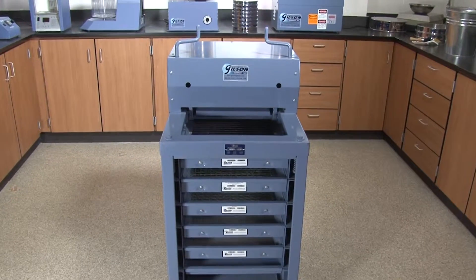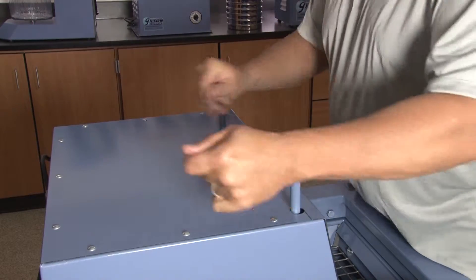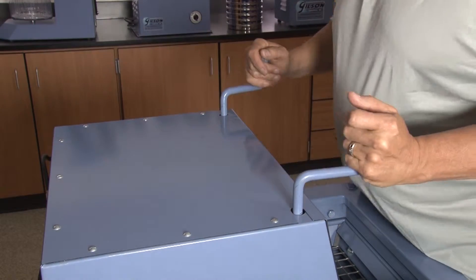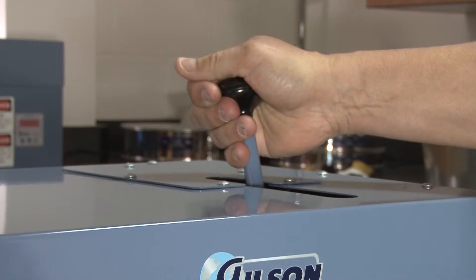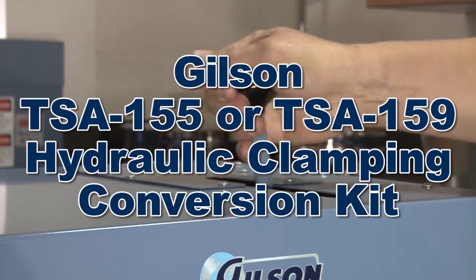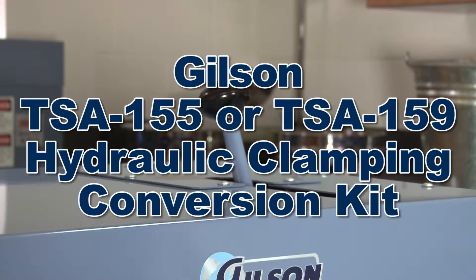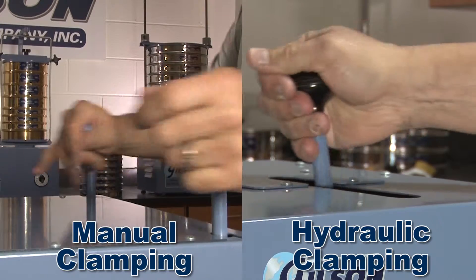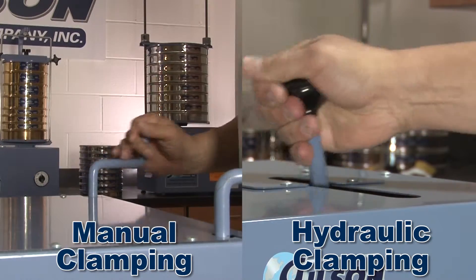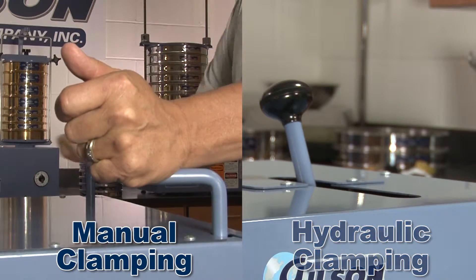Labs with existing TS2 models, with its manual tray clamping system, may increase operational efficiency by upgrading their unit with the Gilson TSA-155 or TSA-159 hydraulic clamping conversion kit, which transforms the TS2's tray clamping system to the same fast-acting hydraulic clamping system used in our popular TS1 models.